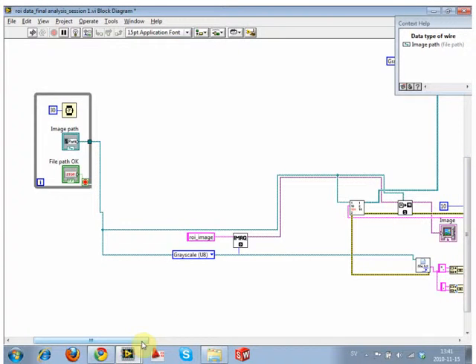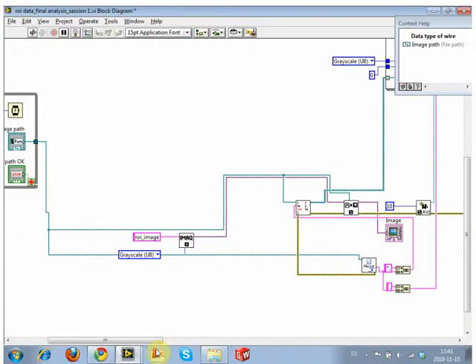Okay, so to start off with, figure out why we're flowing both ways here. That's just because it's not optimized. To start off with, we need to make our analysis folder.